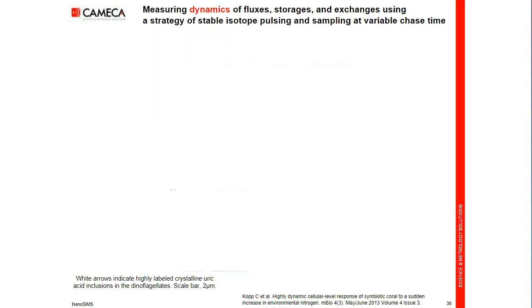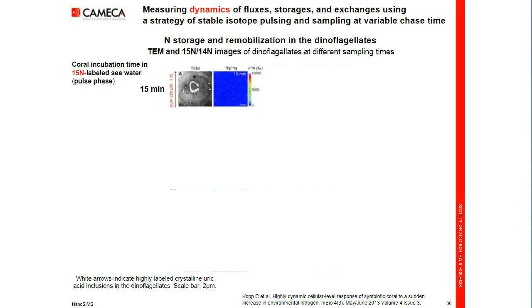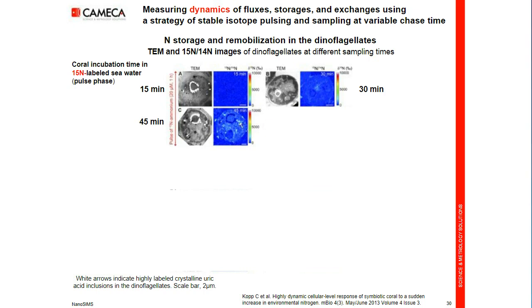Then, by extracting samples at various times of the experiment, it is possible to measure dynamics. So in this study, samples were extracted at different times of incubation with the nitrogen-15: 15 minutes, 30 minutes, 45 minutes, 60 minutes, and one can see the storage of the nitrogen-15 from the seawater by the endosymbiont.